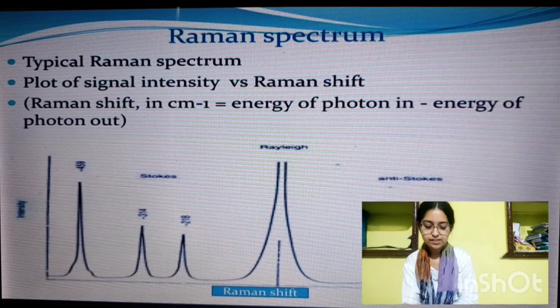It essentially creates a fingerprint of the molecule, revealing details about its vibrational modes, and provides detailed information about the chemical structure, phase and polymorphy, crystallinity and molecular interactions.